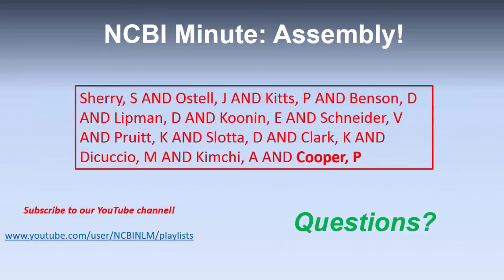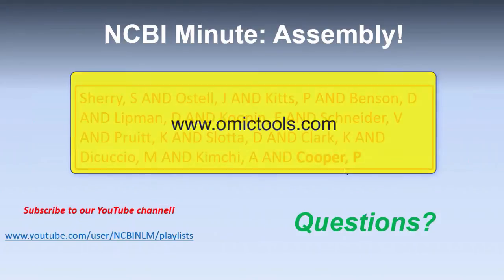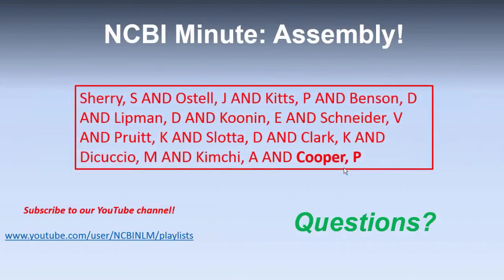So do we have any assemblers on NCBI? We do not have assemblers on NCBI. It's a good question. There are a couple of websites that outline assemblers. I cannot endorse anybody's product, so I can't speak to pros and cons of different assemblers, but what I can say is omictools.com is a pretty good place to look for a listing of tools for this type of thing, including assemblers. Some popular ones are Velvet, SOAPdenovo, ABySS. There's a bunch of them. Also, Broad has an assembler comparer called MetAMOS, so you might want to check that out.